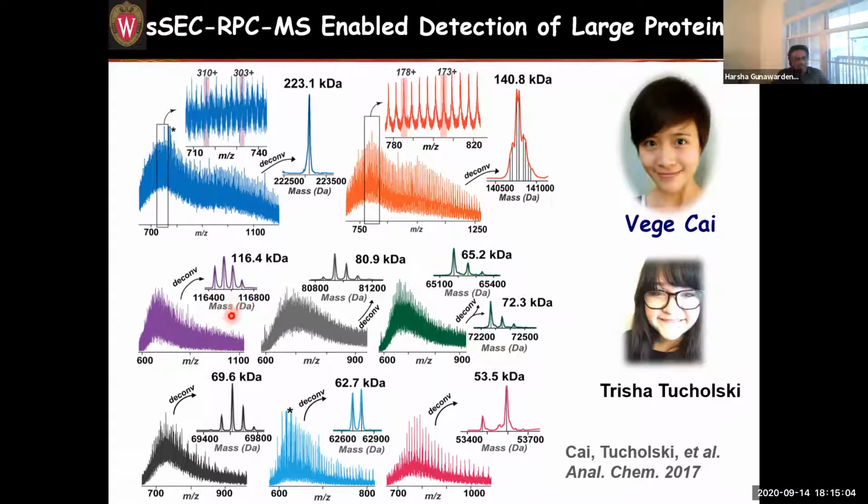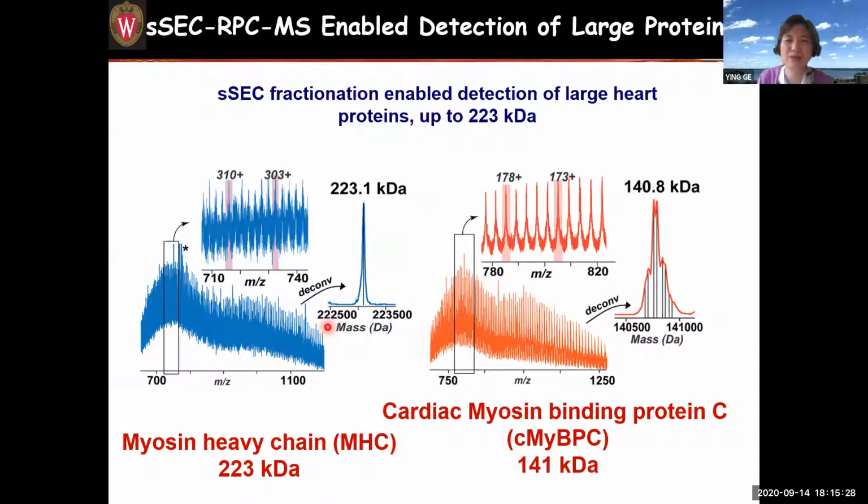If you don't get the right answers, you'll be really off. Sometimes a deconvolution seems too good to be true. It looks beautiful, but how much data manipulation is in the process, we don't know. But you're right, you need multiple algorithms to double check.